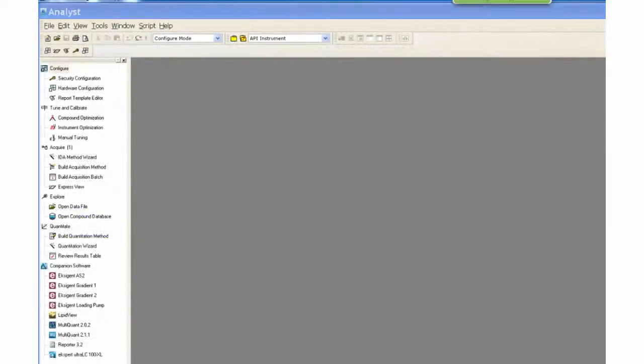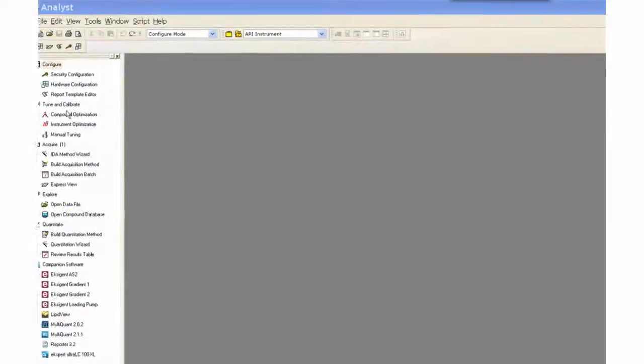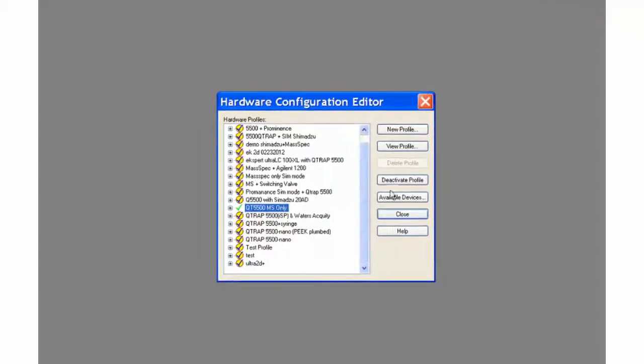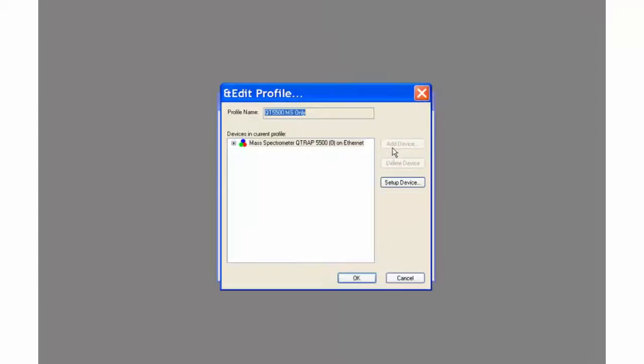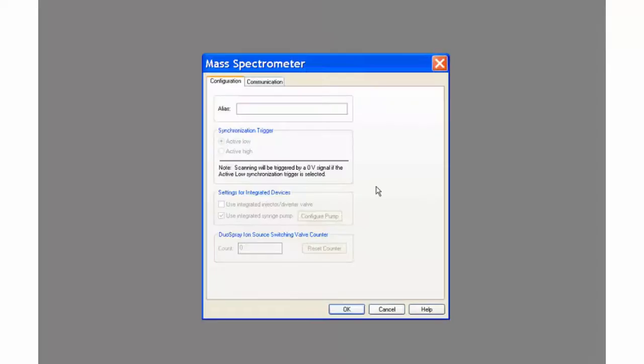With Analyst open, confirm that in the hardware profile, the syringe pump is active.